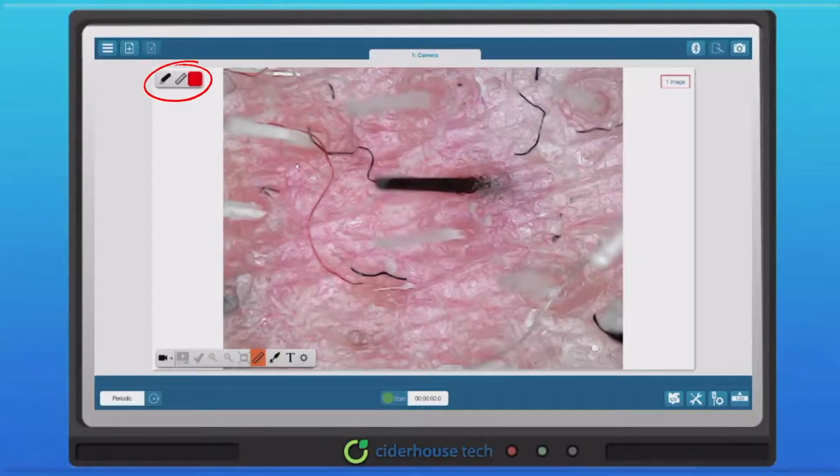It is possible to change the color of the ruler. Click to where you want to measure from. Then drag your cursor to the end of the required measurement. If a known measurement is available, such as a slide scale, we can calibrate the ruler.